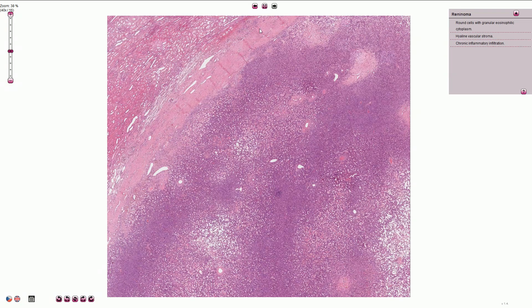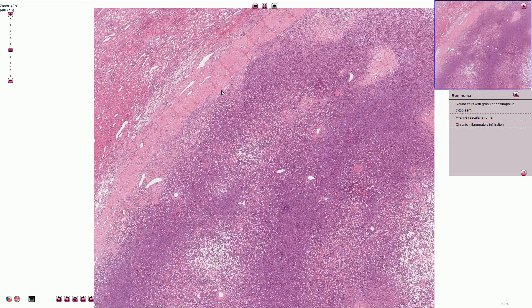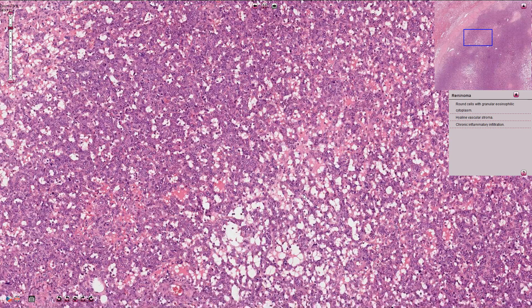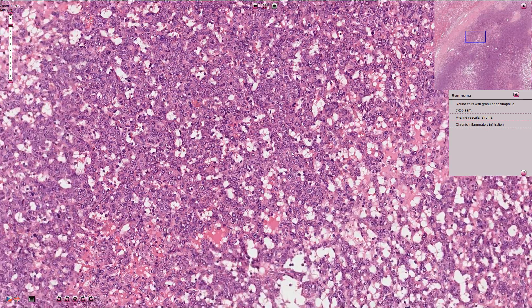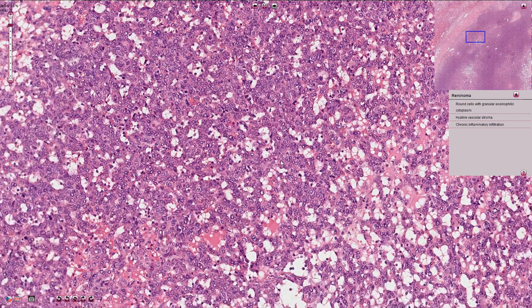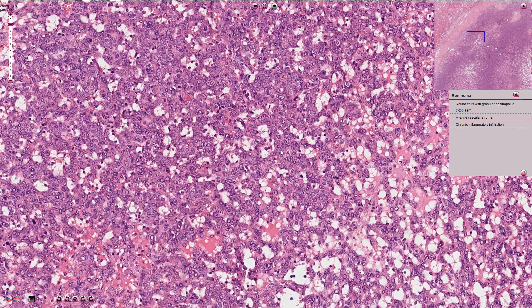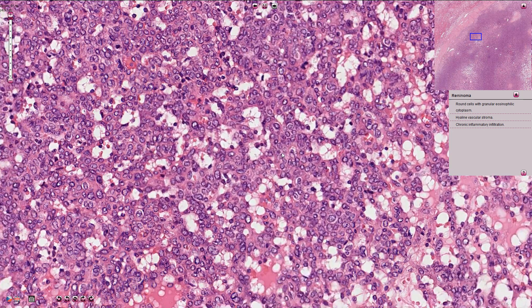In this part of the slide we have normal renal parenchyma, and here we see a well-circumscribed encapsulated tumor. The fibrous capsule is quite thick and usually prominent. The tumor is composed of uniform cells with round nuclei and granular, slightly eosinophilic cytoplasm.